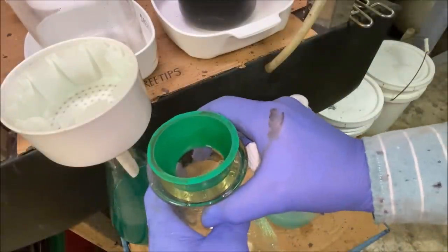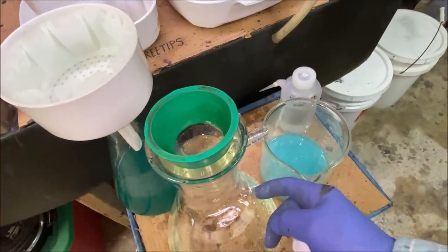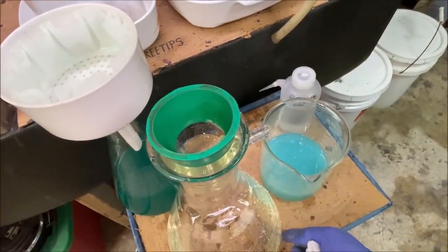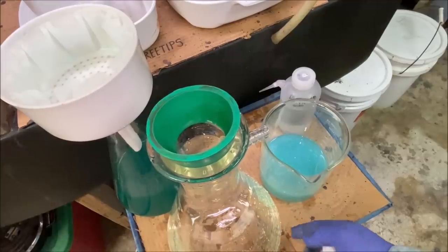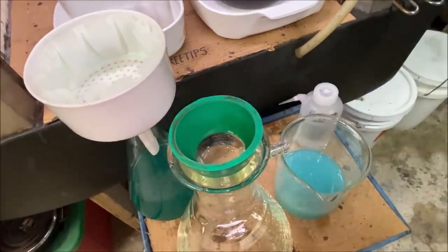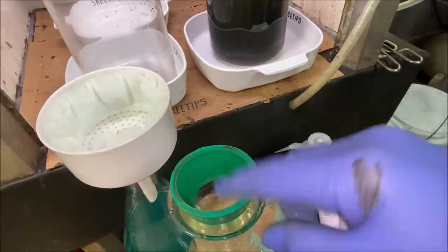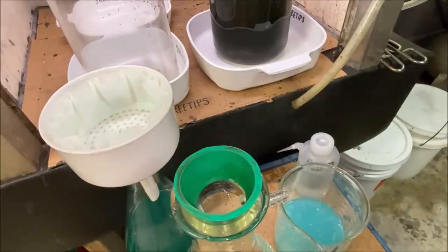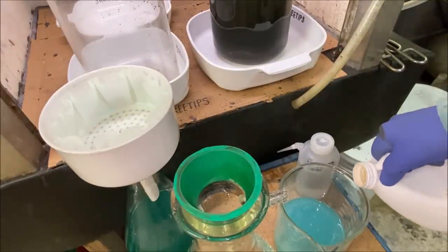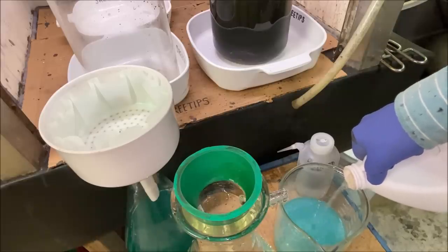I've rinsed the flask out. I was trying to take a shortcut here. It had a little bit of silver nitrate, what I thought was silver nitrate down in here. And since what we were filtering was silver nitrate, I thought we could just go ahead and put it in on top. But there must have been some hydrochloric acid in there. So a classic example of a shortcut ended up costing us more time and effort.